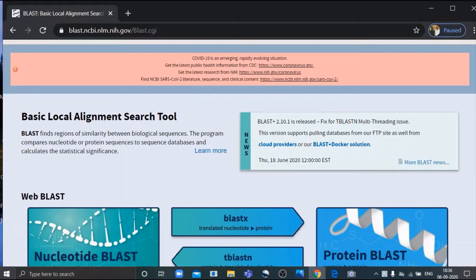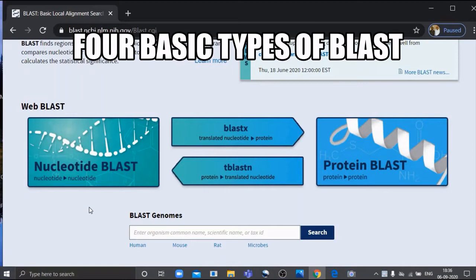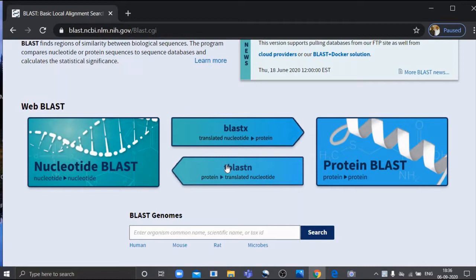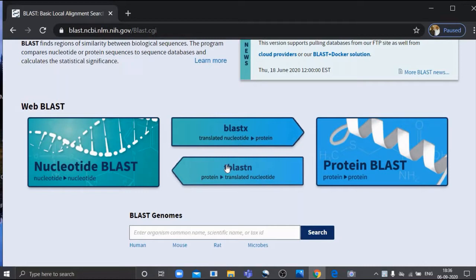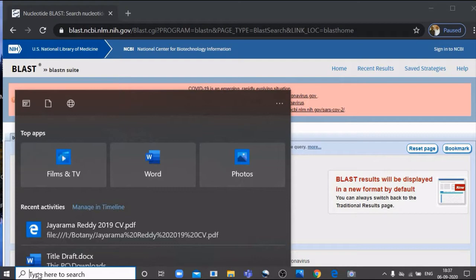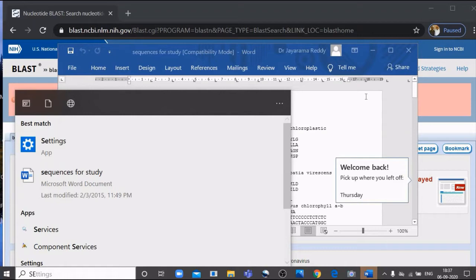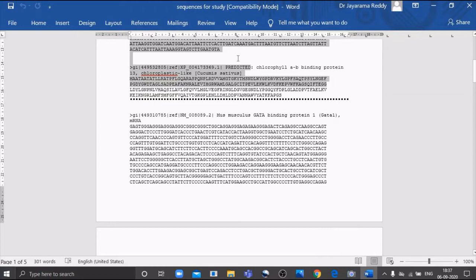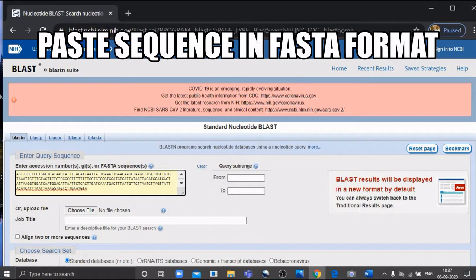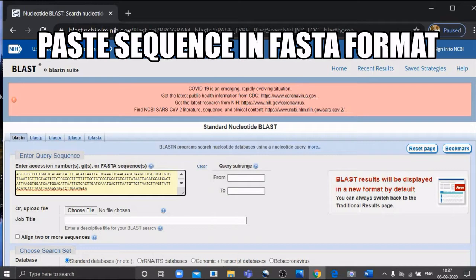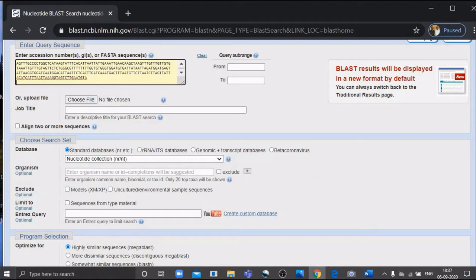On the NCBI BLAST page you can see two important tools: nucleotide BLAST and protein BLAST, which are the most widely used. In addition to those, we have BLASTX and TBLASTN — these are the four important versions of BLAST. The FASTA format of your sequence has to be pasted in the search region. Sequences may be downloaded from various nucleotide sequence databases such as GenBank, DDBJ, or EMBL, or you can use your own sequences obtained by sequencing.